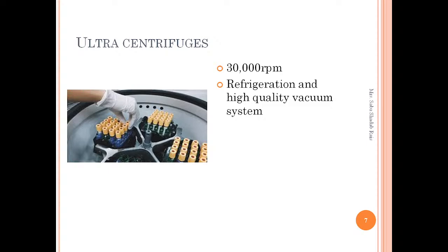So for that particular reason, we make use of refrigeration. And apart from the refrigeration, you can see a high quality vacuum is there. So a high quality vacuum is also generated in this particular type of centrifugation machine.